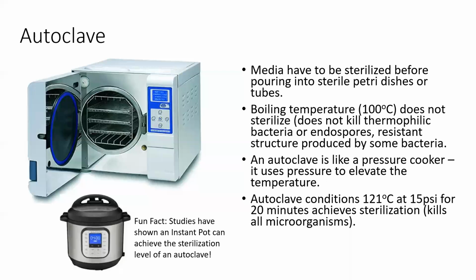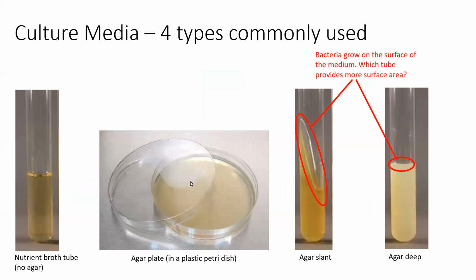But you let the media cool for a little bit. But then because it's still in liquid form, you can pour it into these plastic Petri dishes, or you can pour it into glass test tubes. And then as it cools over time, takes anywhere from about 15 minutes with agar plates to maybe even a couple hours with some of the test tube media. But as it cools, it does solidify.